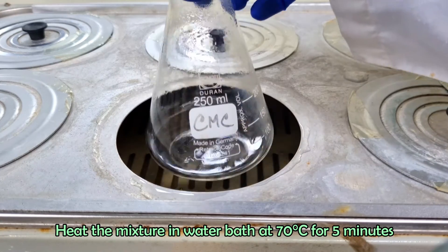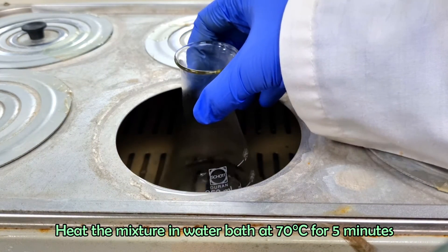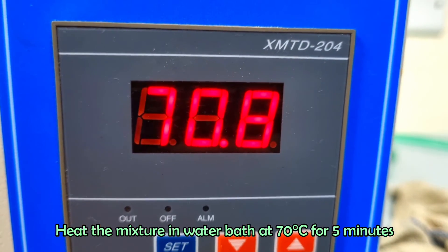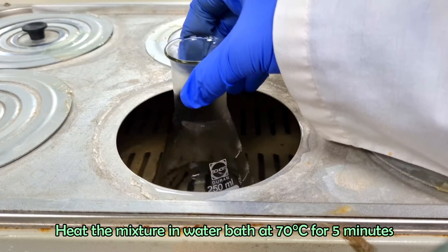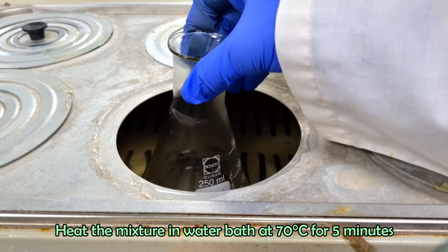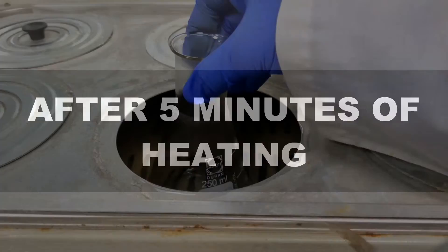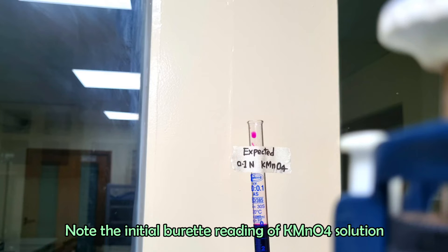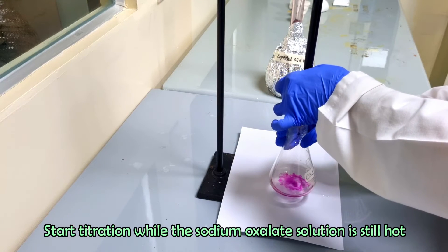Heat the mixture in a water bath at 70 degrees Celsius for 5 minutes. Take out the flask from the water bath immediately for titration. Note the initial burette reading of the potassium permanganate solution. Start titration while the sodium oxalate solution is still hot.